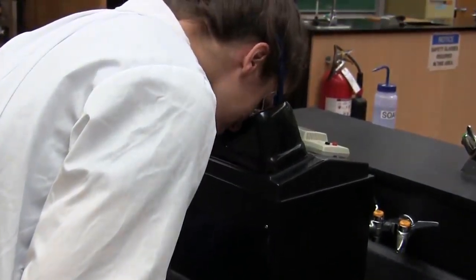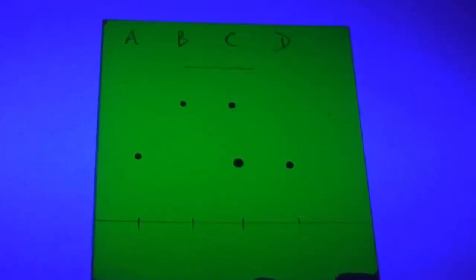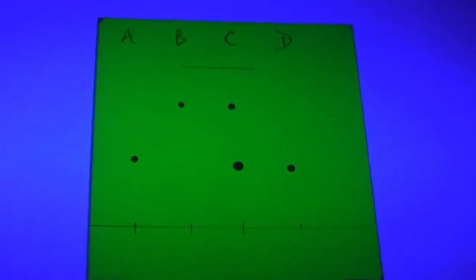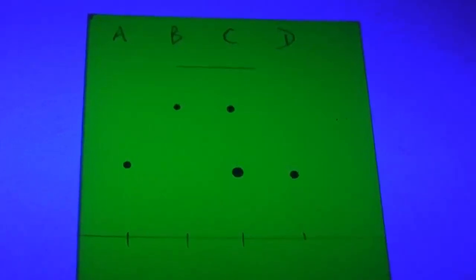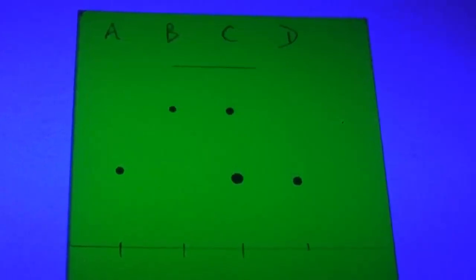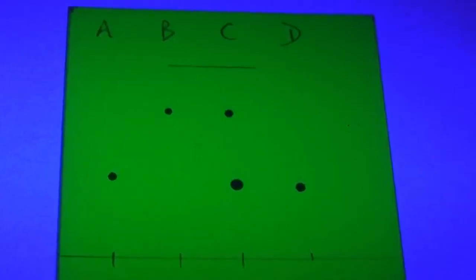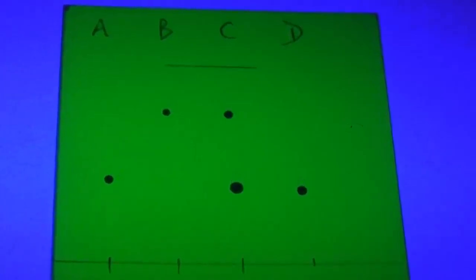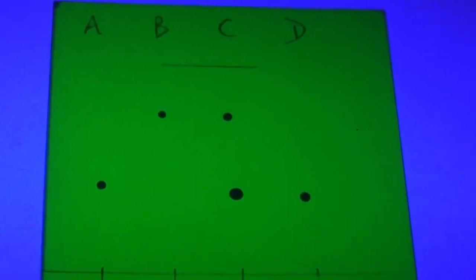If a fluorescent indicator is added, the silica will fluoresce under UV light. Chemicals on that plate, however, will usually show up as dark spots. Sometimes, when the chemical on the plate is UV active, the spot will fluoresce a different color than the silica and be visible in that way. But most compounds will just show up as dark spots against the fluorescent silica background.